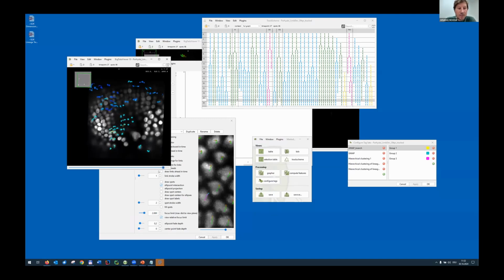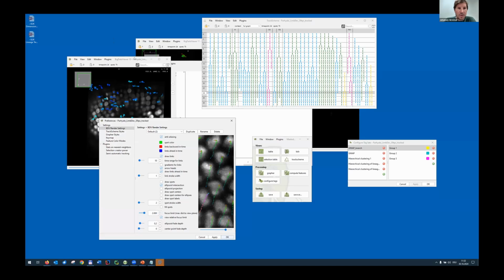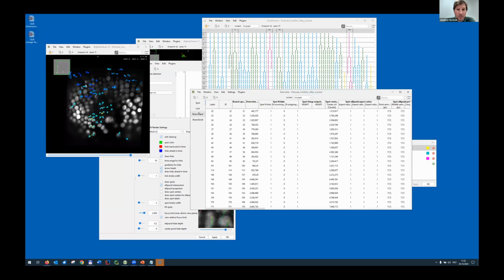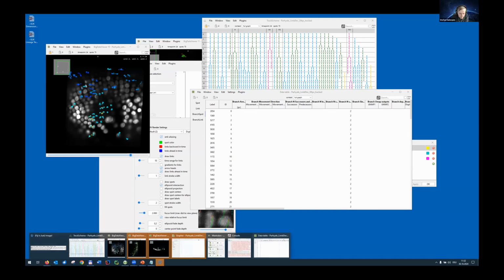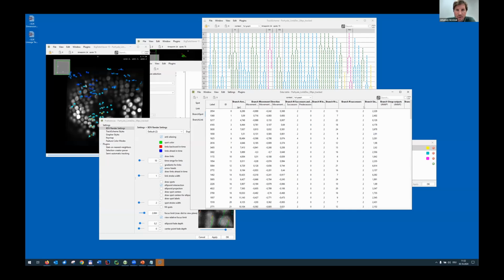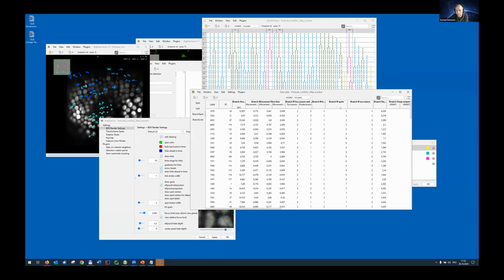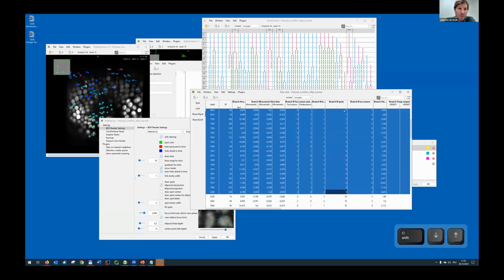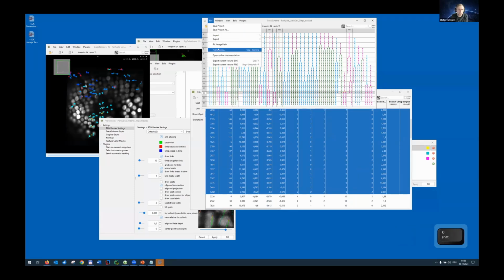There was also a question if you can sort them by length, like the length of track, and that's totally possible. So that one could do, for example, again in a table, right? After you computed the features, thanks for showing. So we haven't features in there now, but we can very quickly, for example, just do it for the branches, fill up the table, and then look for different lengths. So that's the branch and spots, for example, yes. And then exactly. That's what I also use to get rid of small ones, but we could also highlight the color, right, Stefan? So we could, for example, use branch and spots as a feature to color the long ones. Yes. And so that's something we could also maybe quickly show.